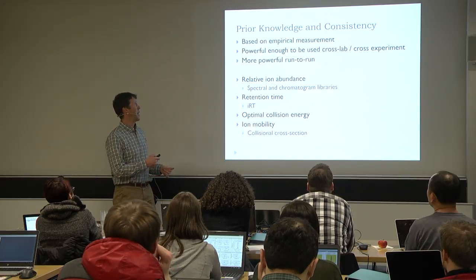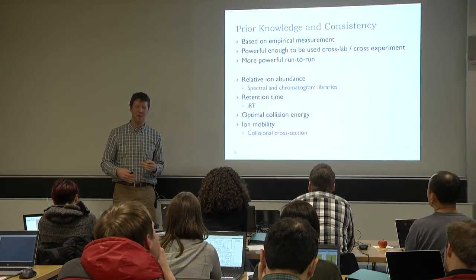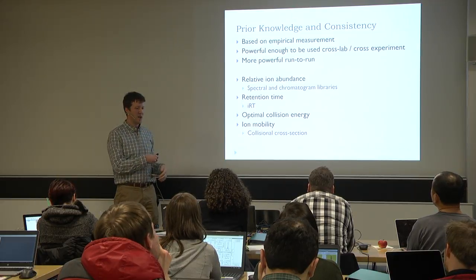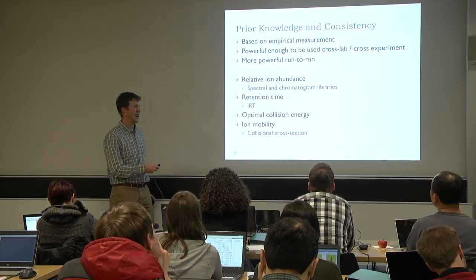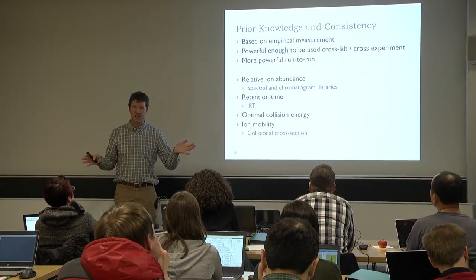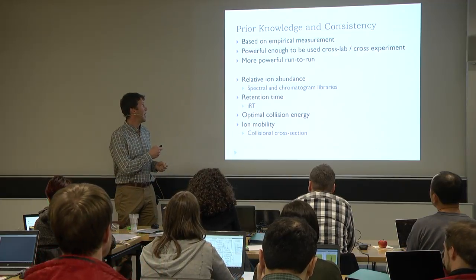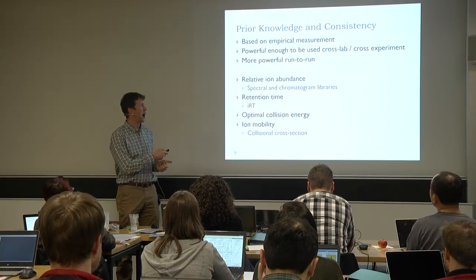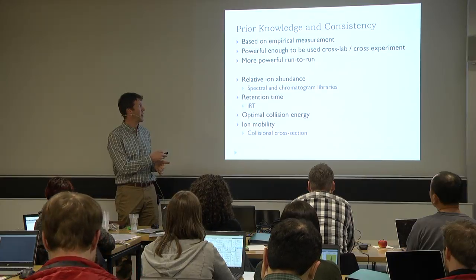One of the important precepts of targeted proteomics is that you can become familiar with what you're measuring, and you can store information about it and reuse it over and over again, and you can get better measurements because of that, rather than just passing the data always the same way through tools that don't know anything about it. So this prior knowledge is based on empirical measurement, and it's powerful enough to be used across labs and across experiments.